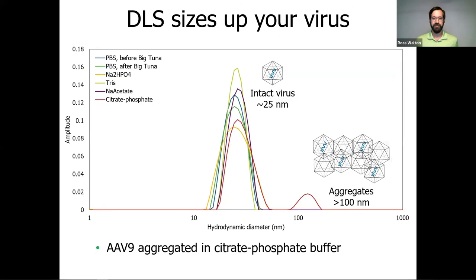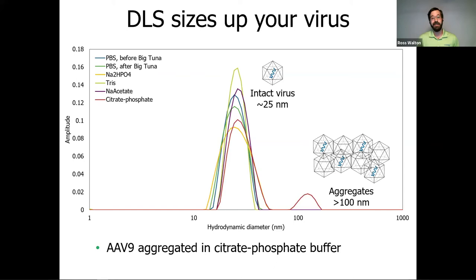DLS is a tool to look at the size distribution of particles based on scattering intensities over time. In most buffers and in the starting material, we had a single peak in the DLS intensity distribution, meaning all particles were monodispersed and about 25 nm in size — what you'd expect for an intact virus. However, the citrate phosphate buffer, shown as the red line, had a second peak much larger than an intact virus should be — those were aggregates. Since the ELISA is specific for intact particles and doesn't bind aggregates, that explained why percent recoveries were so low. This shows the value of using DLS before an experiment as a quick check.